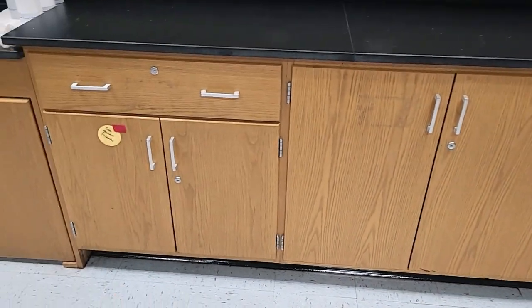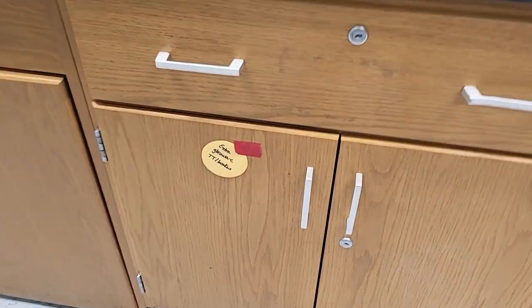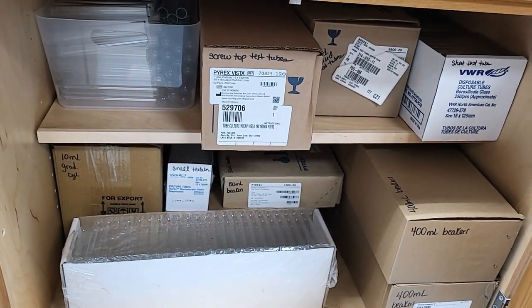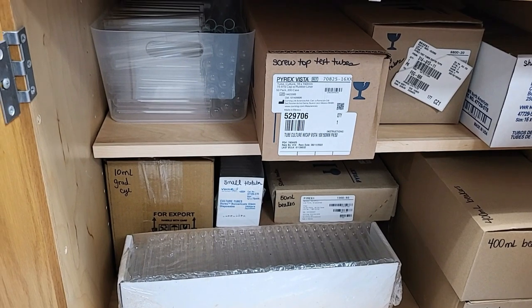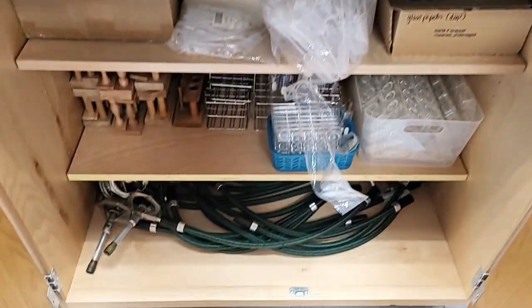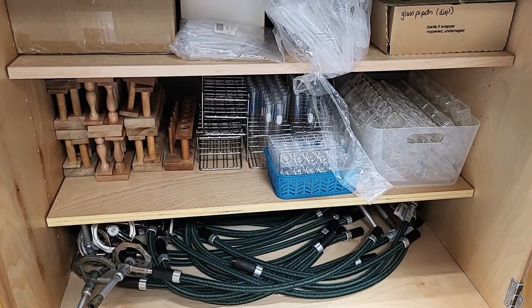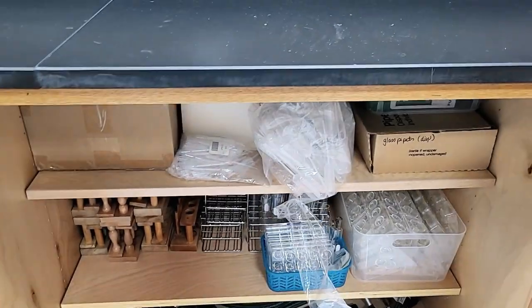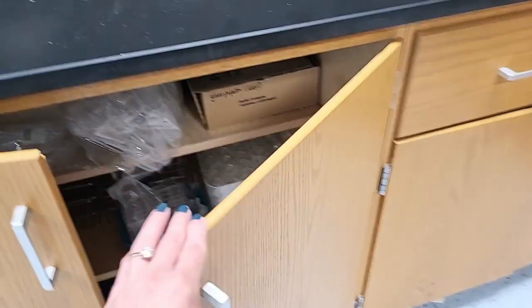And then this part down here is all my extra equipment. So for example, in here, I've got extra glassware. I'll just show you what it looks like. So I've got my extra beakers and my test tubes. I did try to use bins wherever possible, because some of these boxes are huge, but there's not a whole lot of, for example, test tubes in them. So I didn't want to use this gigantic box. This has some other stuff, like test tube racks and Bunsen burners and my well plates. And again, the plan is to obviously label all this stuff so I know what it is.